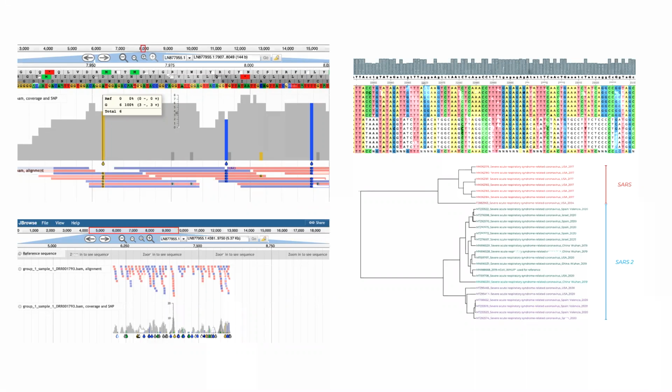And once we know where they come from and they are aligned, so they are positioned to the correct reference on the genome, we can then start asking the question, for example, what might be the result of finding a particular mutation, a particular variant?